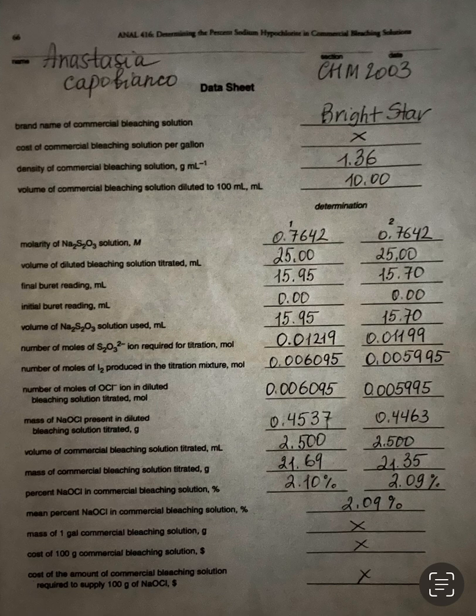For the first determination, it was 0.006095. For the second determination, it was 0.005995. How do we find the number of moles of hypochlorite ion in diluted bleaching solution?